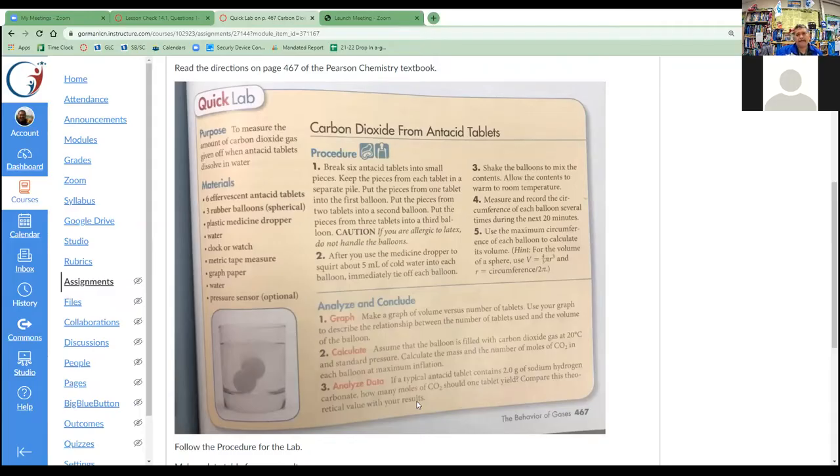little bit. We're going to do the lab here and then get the information, then we'll measure the balloons, give you the data, put it in a chart, but then we'll have you do number 5, 1, 2, and 3 separately, and we'll come back in a separate video, I think, and discuss all that.